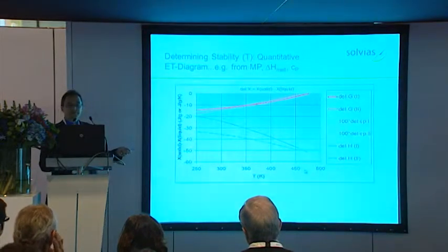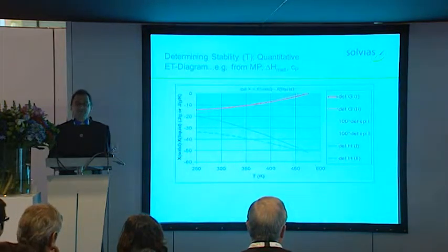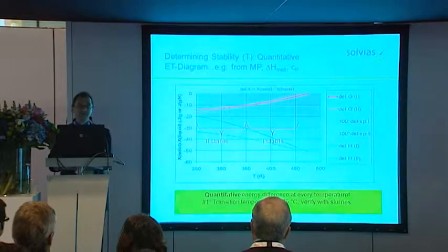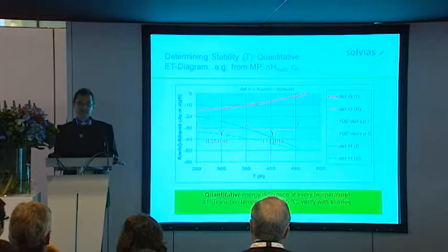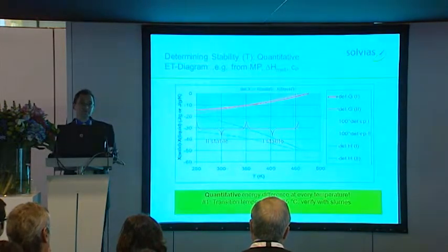is the free energy of form 1 and form 2 as a function of temperature, and you can see the free energy of these two forms cross over at a temperature of about 75 degrees centigrade. So this would be a case where we have two enantiotropic polymorphs, with a transition temperature which is important for your crystallization process.